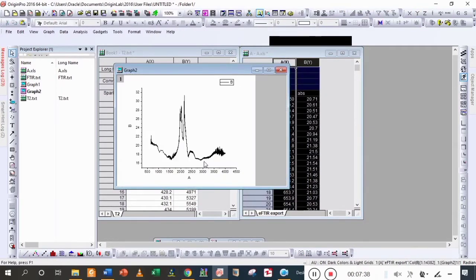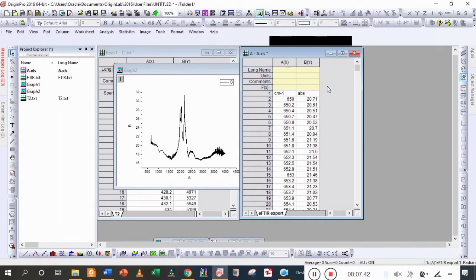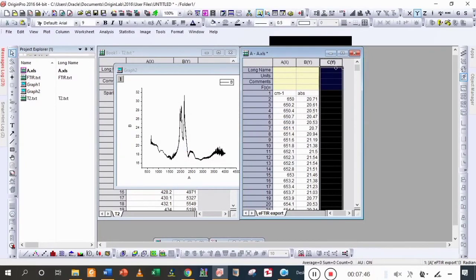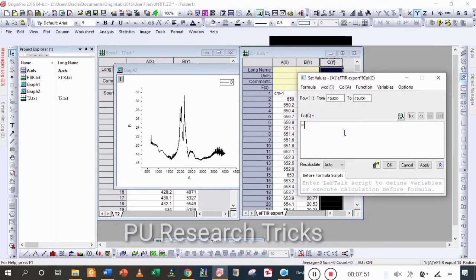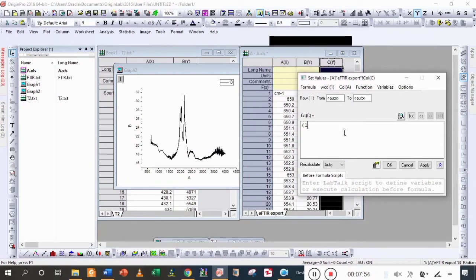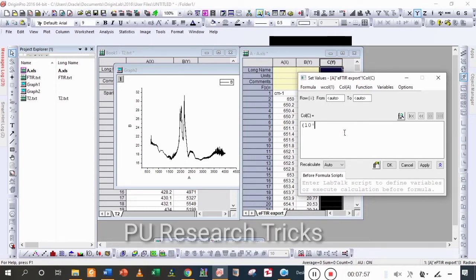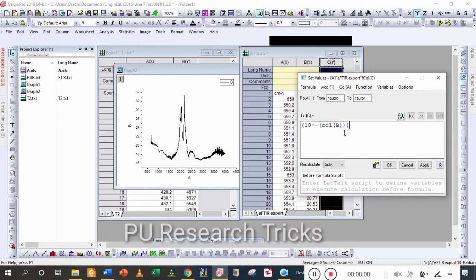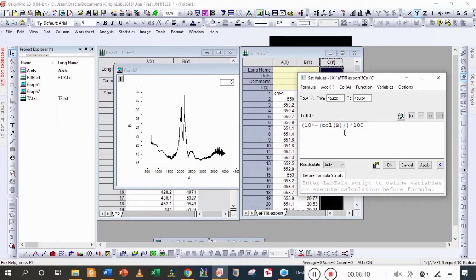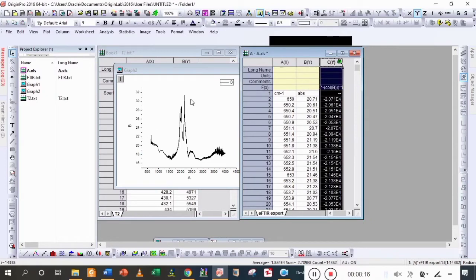Here are the peaks of the absorbance data for the second graph. Again the same process: Ctrl+D, select all, set column value, and write the formula — equal to 10 to the power of minus column B, because column B is the intensity. Apply and then you can see that we get some new values.